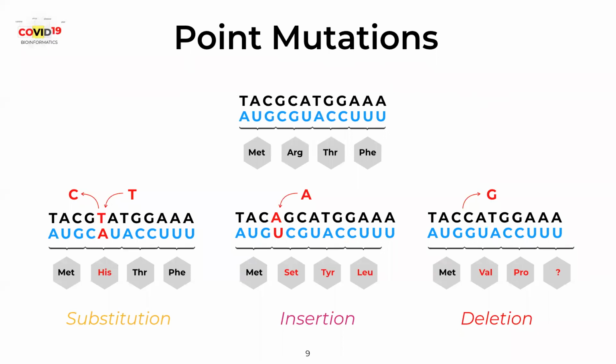When we compare sequences of two genomes in a FASTA file, we will be looking for variation. Typically, we'll be looking for a single point mutation, or what's called a single nucleotide variation. These can be substitutions, insertions, or deletions. Such changes have differential biological significance because a single nucleotide change can result in changes in the codon, which is a set of 3 nucleotides strung together that are recorded in mRNA, which will be translated into protein. Remember that proteins are our functional element.